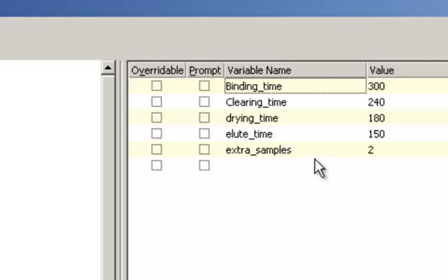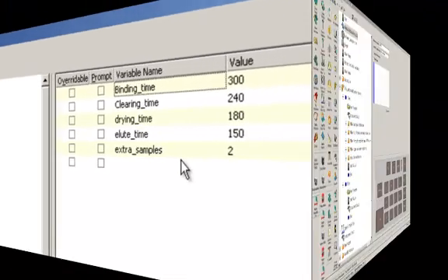The other variable here is your extra samples. Basically at the beginning of the method you're going to have to set up a pattern that tells the method where in a 96 well plate your samples are. The method will then count how many wells you've selected. It will add this number to that number and tell you if you're making the master mix or if it's making the master mix. It will create some extra master mix. Just due to pipetting errors you want to have a little extra. We have it set for two here. You may need to increase that if your system is not as accurate. If you're running more samples on a 96 well plate you may want to make that number larger also.